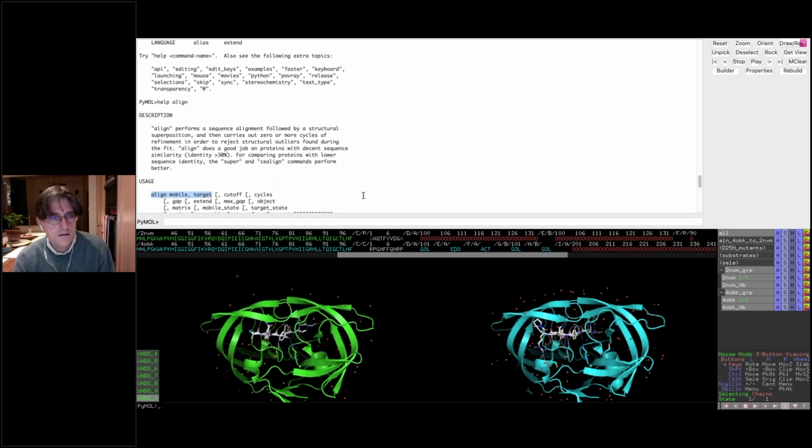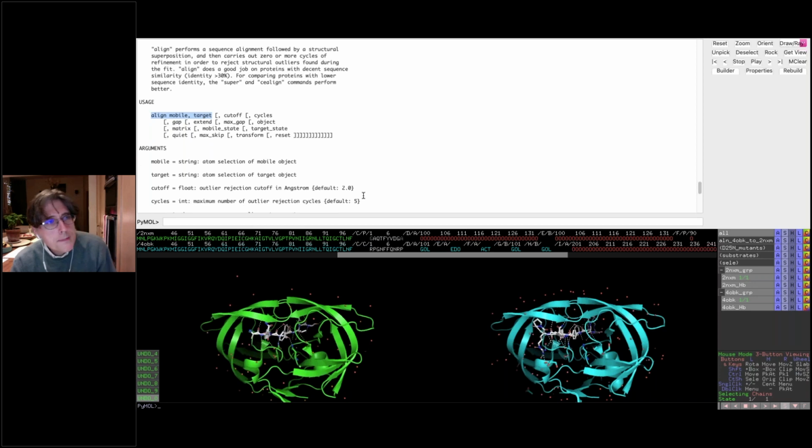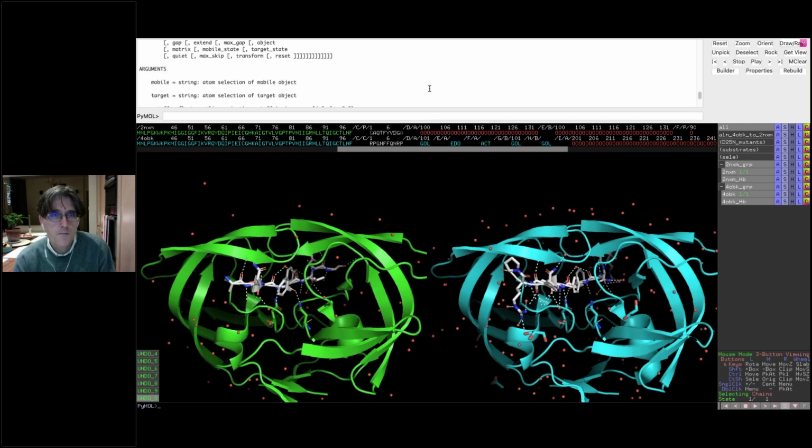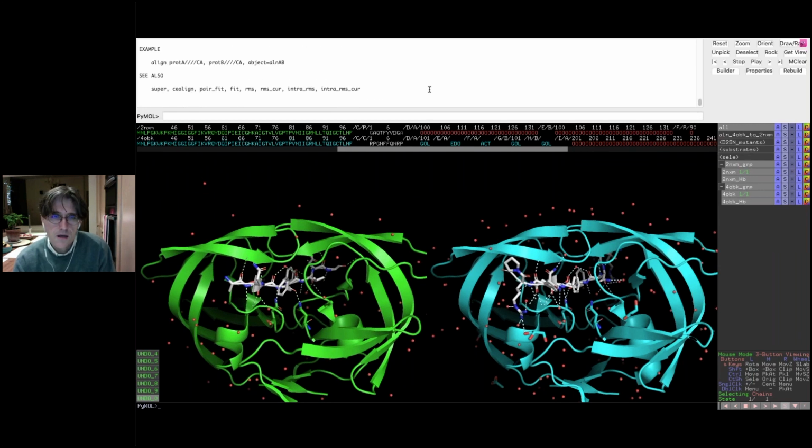Chris, is there a question? Yes, a couple of people have asked, is it possible to visualize docking results? Yeah, sure, it is. You can actually load PDBQT files in PyMOL. They're close enough to PDB files that they'll behave like PDB files. You can certainly load up SDF files and play through them using the play button down here or the arrow keys on your keyboard, going through them one at a time. And again, use these tools to find interactions and so on.